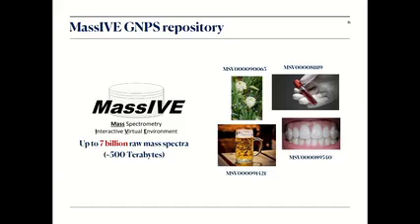But what does exist is a huge repository of up to 7 billion raw mass spectra. And the bad news about it is that it's completely unannotated. We don't know any molecular structures or pretty much any information about the corresponding spectra. But the good news is that this data is really huge and it's diverse, coming from diverse biological and environmental studies.